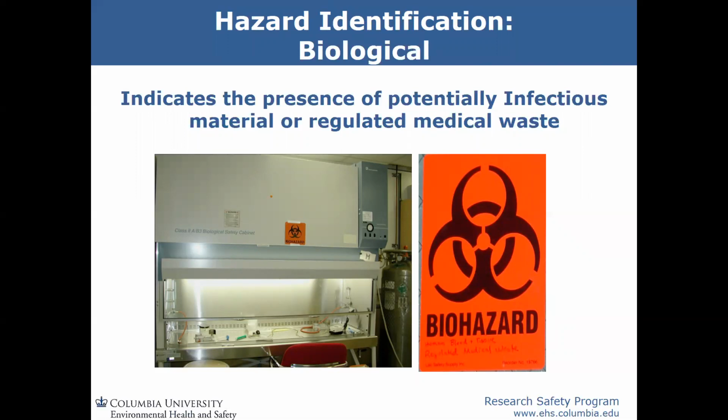Okay, so typically these devices will bear the universal biohazard sign. It reflects that this laboratory may be working with potentially infectious materials.